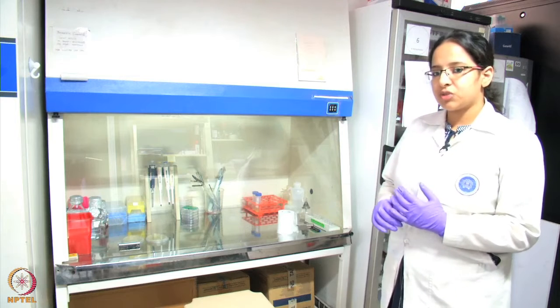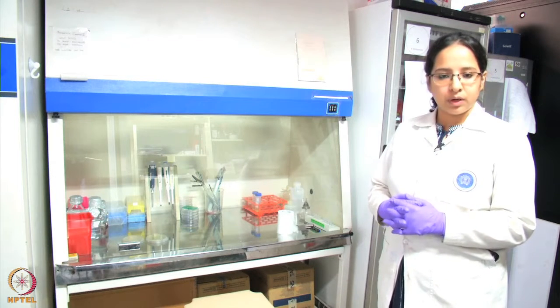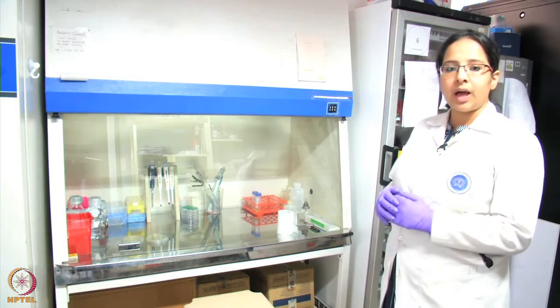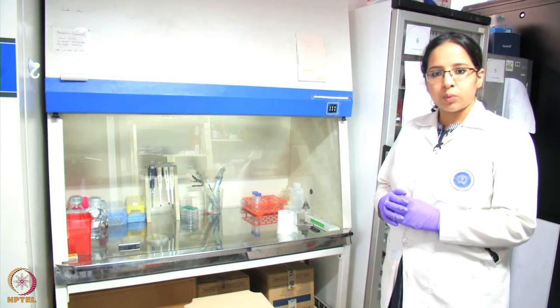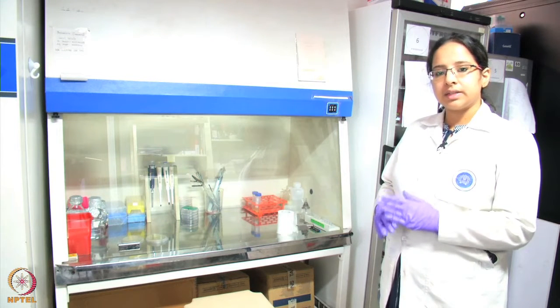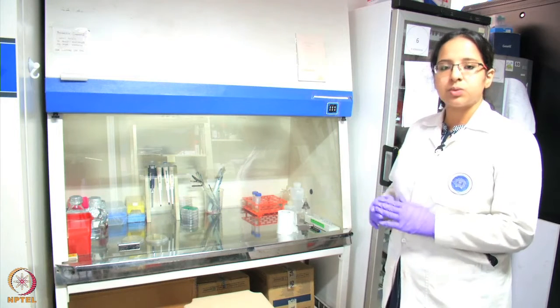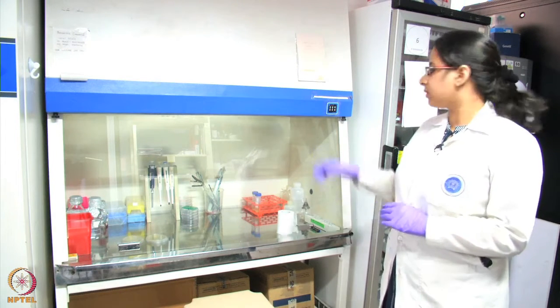This transformation step is carried out inside a laminar hood under sterile conditions. Inside the hood we have sterile filters which keep the inside air clean. Before we start with the experiment, first we switch on the UV for 10 minutes.